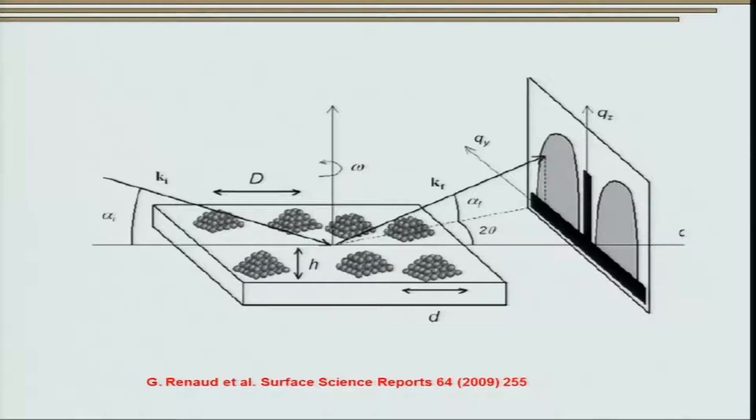If you look at this particular image, you can see that you just have one condition. So there is one scattering from one of these blocks or one of these dots of atoms or a cluster of atoms which we see over here. It can be a quantum dot or a nanoparticle. However, this is not the only case that can be expected. Let us assume that you are incident at a different angle, you get first reflected from the surface and then you bounce off and you go through this particle, right. There is a distinct probability of this happening. Let me show you what exactly I mean.